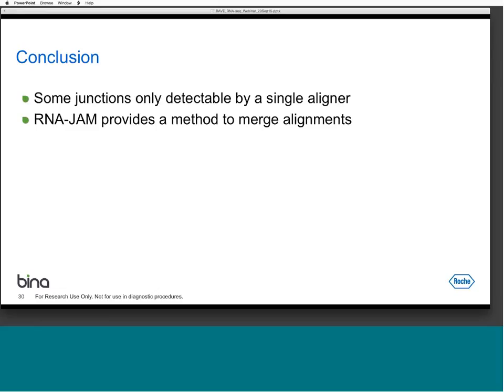In terms of other future work that we're working on to improve RNA-Seq results, we're working on incorporating 3rd-generation sequencing into our RNA-Seq workflow, which is able to capture long isoforms and get long-range information between exons. And also, we're working on workflows for gene fusion detection, allele-specific expression, and RNA-Seq variant calling.